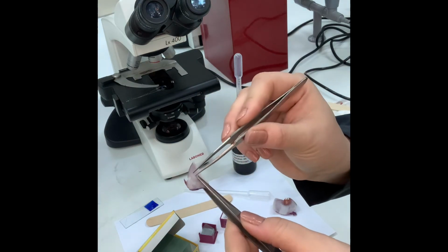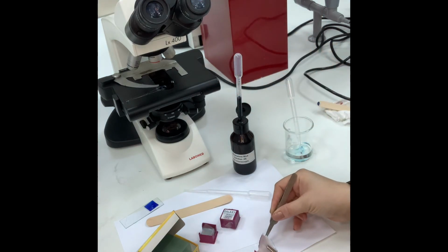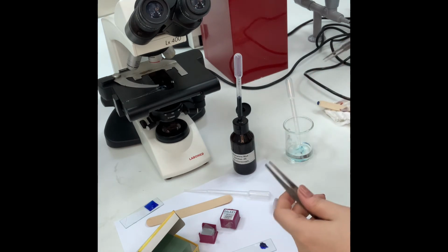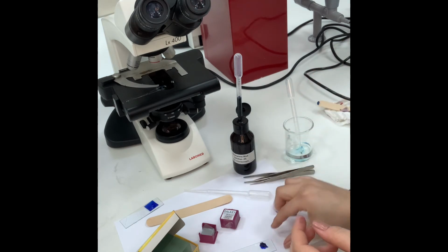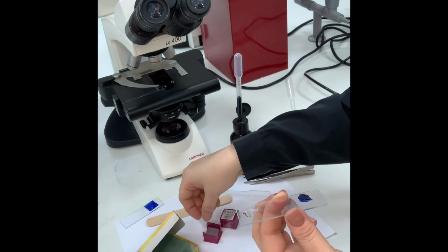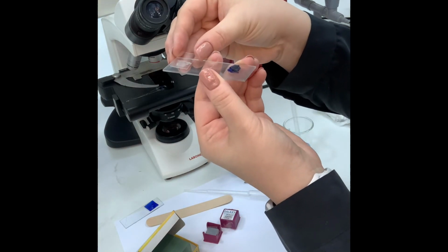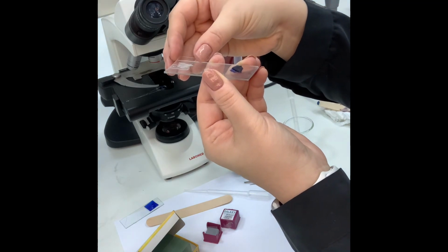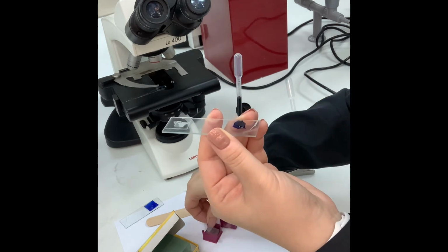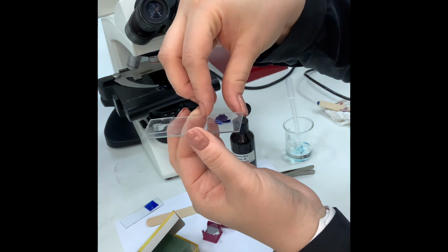And I have another piece over here. See? This one. I will apply it on, and I will add my cover slip as well. Again, I will tilt and try not to drop, very slowly. See? Nothing. Very slowly.